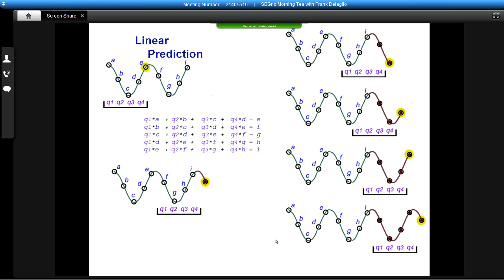There have been several different ways that people have addressed this problem. In biomolecular NMR, the workhorse of helping to improve this situation is linear prediction. And linear prediction improves the situation by adding a collection of synthetic points to the original experimental data.